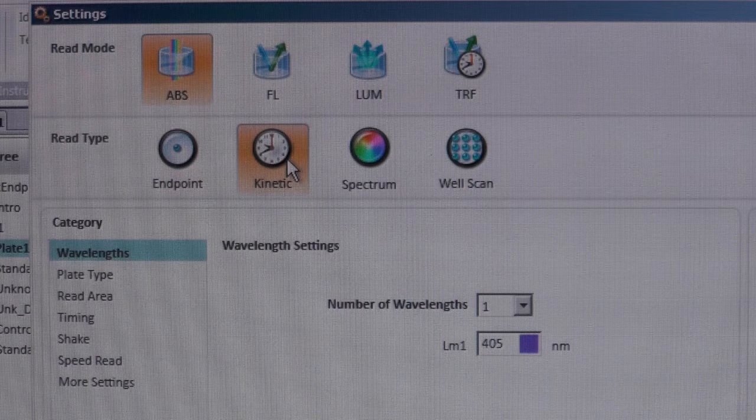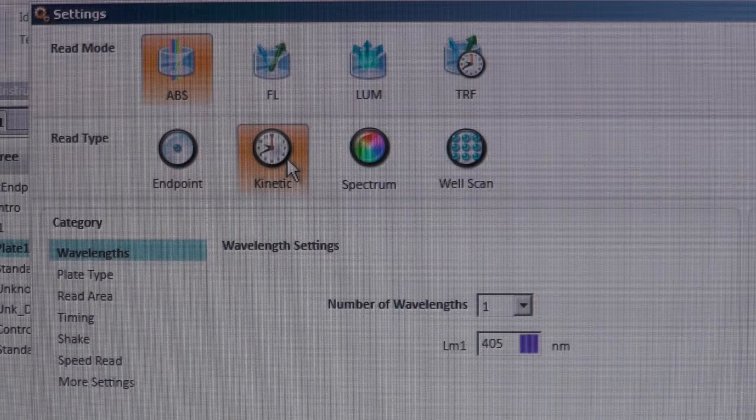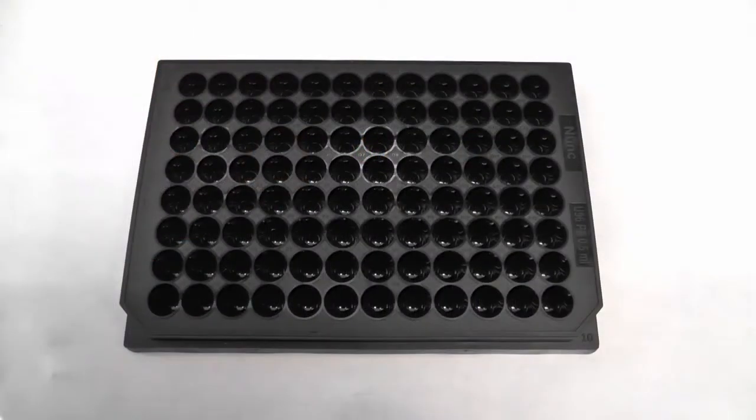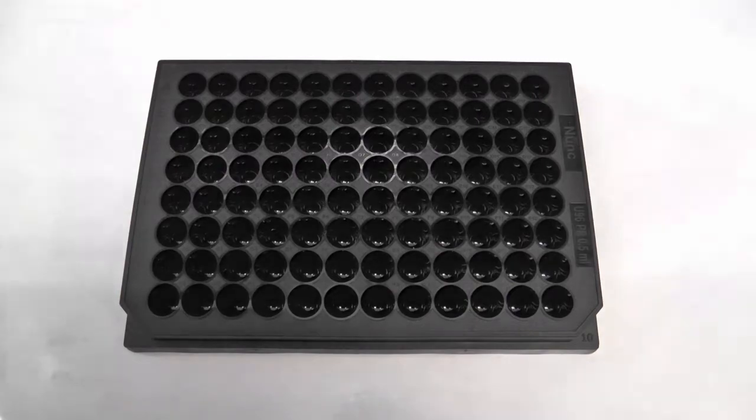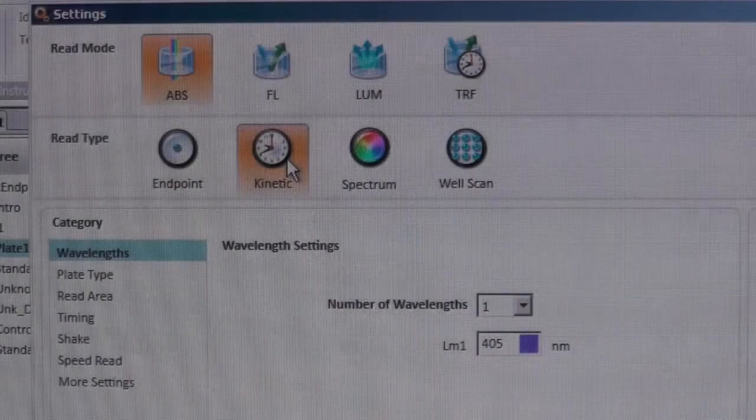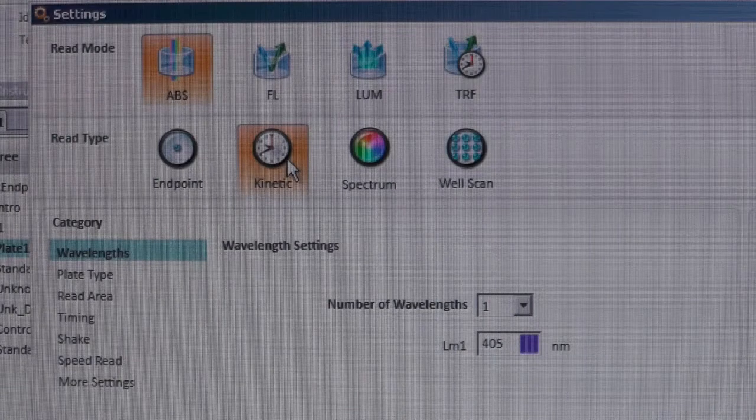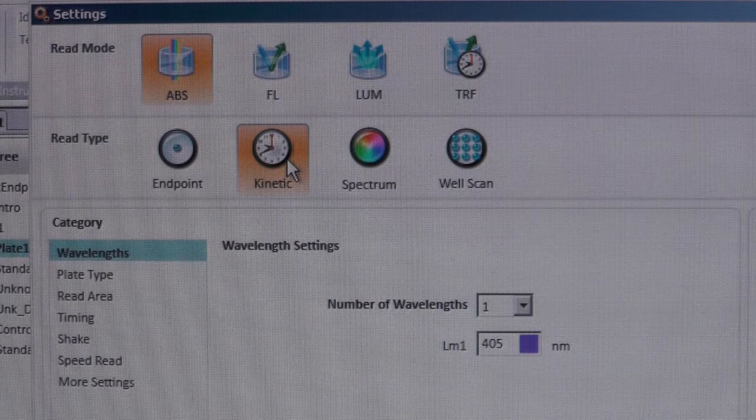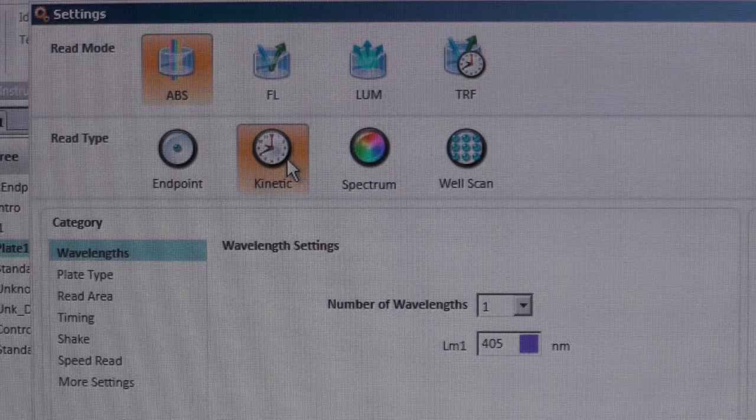You can also measure fluorescence levels in this plate reader. When analyzing fluorescent samples, remember to use black opaque 96 micro well plates. For demonstration purposes, here we will only show how to configure the Kinetic Read option.